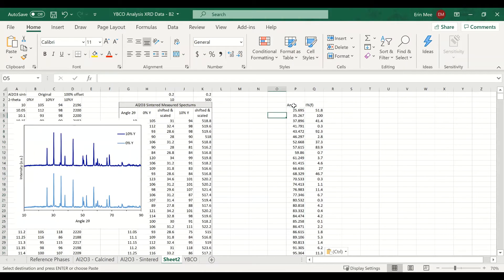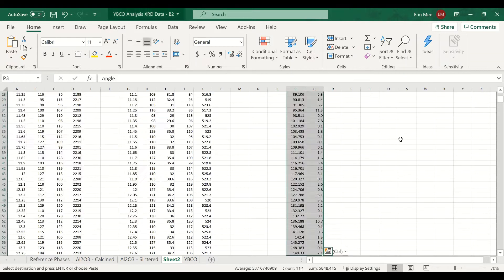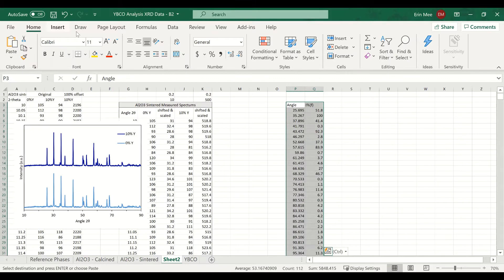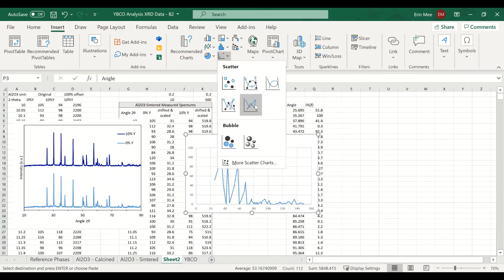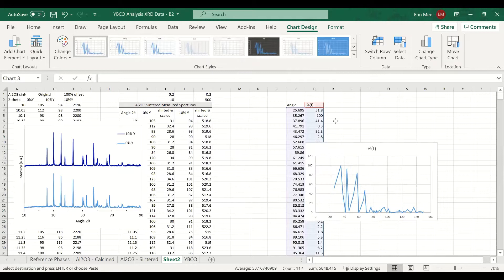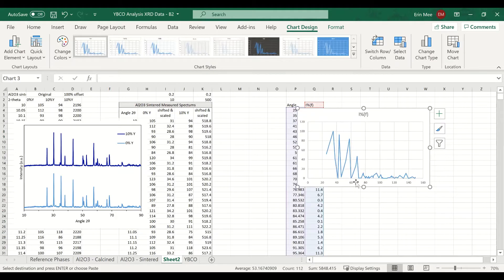If we just graphed this with a line plot, it would look different than what we expect. What we want is a baseline of zero with lines where the intensity is, instead of connecting each intensity value, which doesn't really show what the spectrum is supposed to look like.